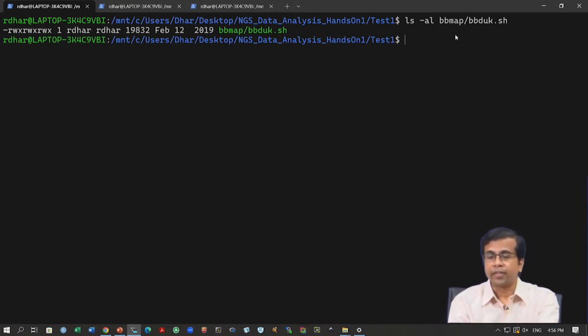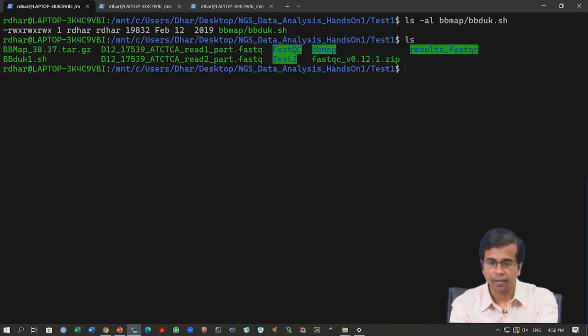So, as I was saying, we have tested different parameter values for this data and we have optimized which parameters actually work the best for these files. Let us see, I have stored this in this file here. Let us look at this.